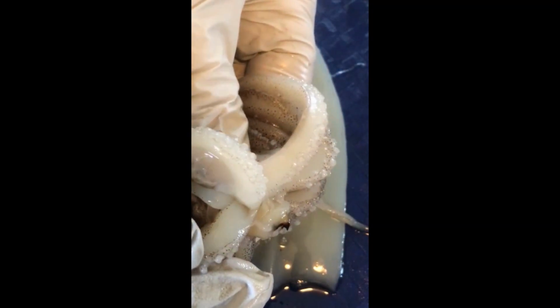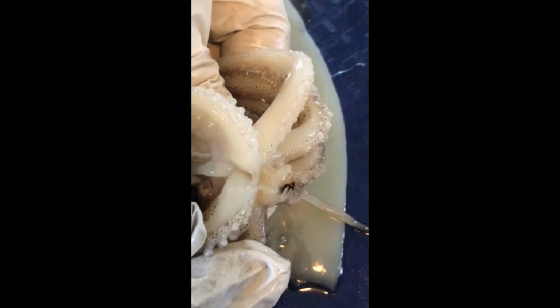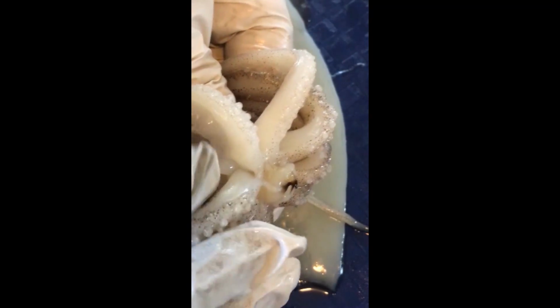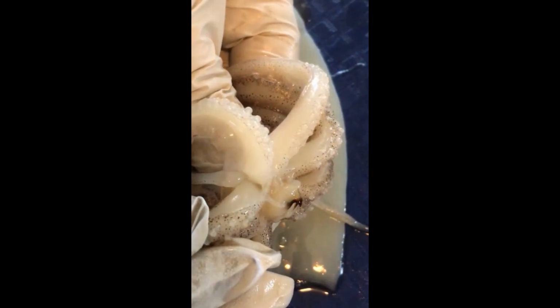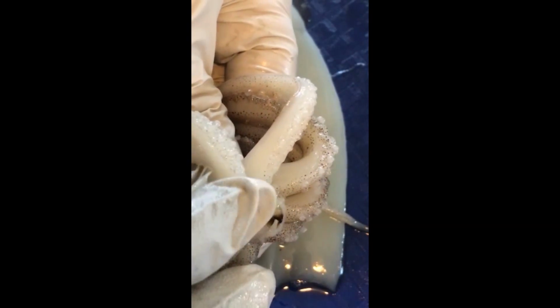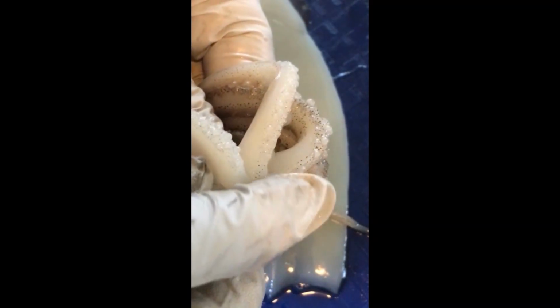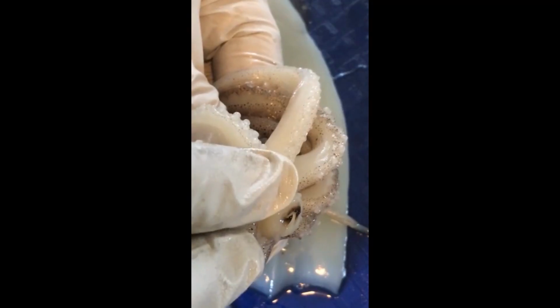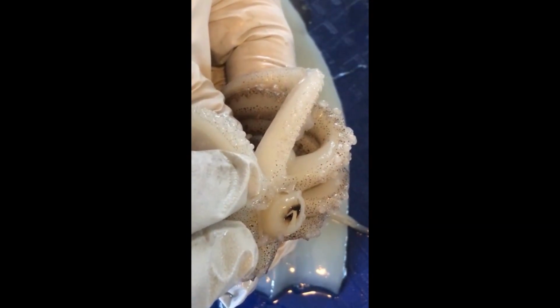you can see this is definitely not something that you want to bite you, because they definitely do some damage, especially the large squids like the Humboldt squid or the giant squid. Some of their beaks can be as big as a basketball. So this one is obviously much smaller. As you can see, it gets the name beak because their mouths look just like a bird's beak. So here's the top and here's the bottom part of that beak.